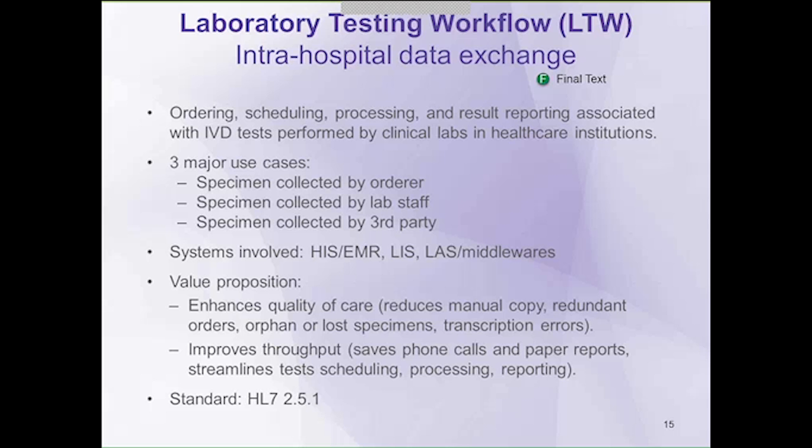And so the value proposition of implementing this profile is, of course, it enhances the quality of care because it reduces manual copy-paste errors, and it reduces redundant orders because you could look them up. The lab will know that there's an order out there that they should have a specimen for, but they didn't receive it, so they can go look for it.